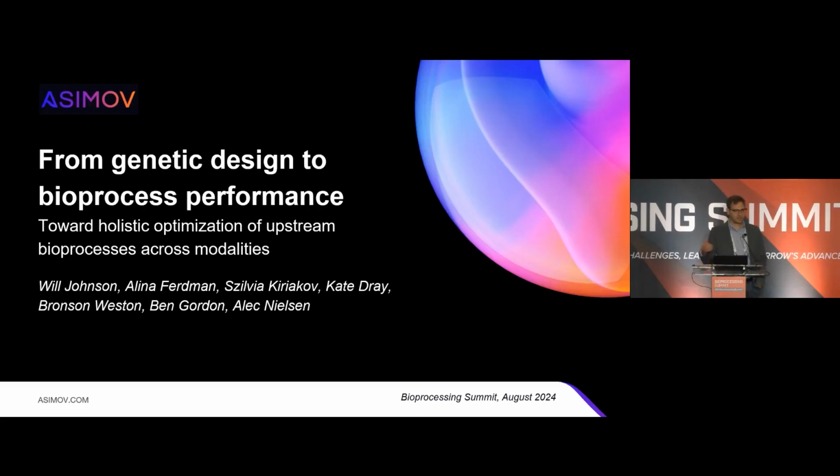So this motivation kind of follows my own professional journey. I started modeling bioprocesses by doing computational fluid dynamics of bioreactors, right? Looking at optimizing oxygen transport. And fairly successful in doing that, and then started asking, well, what about the cells, right? If we want to know about the performance of the bioreactor, we should probably consider the cell's behavior. And about the time I joined Asimov, I had the opportunity to ask, well, what about the cells? What about their genetic design modulates and allows us to achieve higher bioprocess performance?